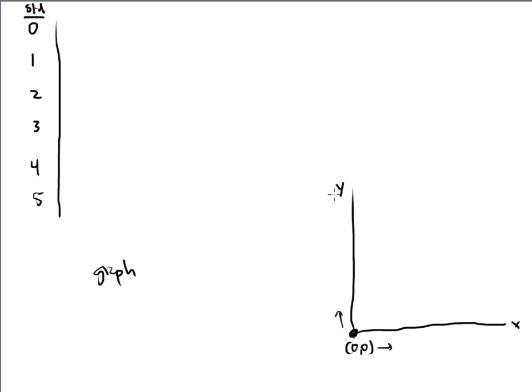But before we do that, we have to have data points to plot. So we have to have x values and we have to have y values. All right, so that means that over here, I need an x and I need a y. Every single time we make a calibration curve, those are the 2 units that we need. The x number is always going to be concentration. Almost every single time it's going to be concentration.